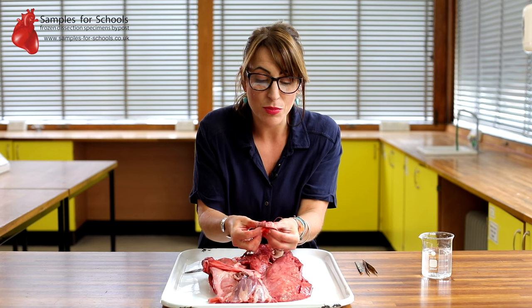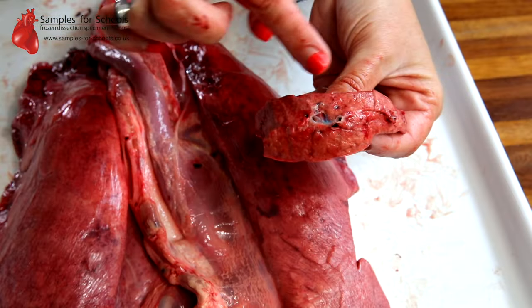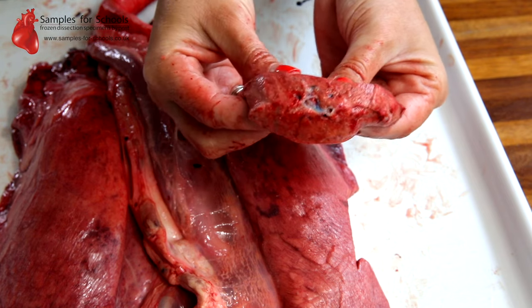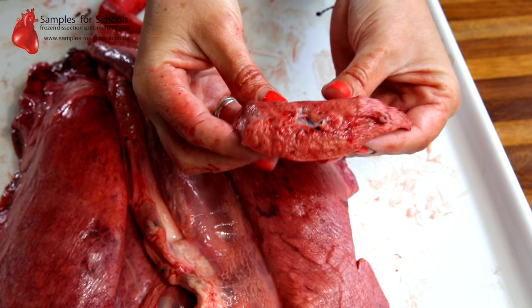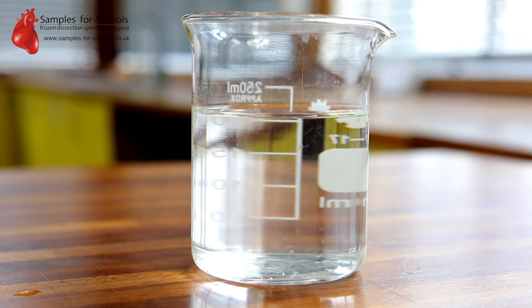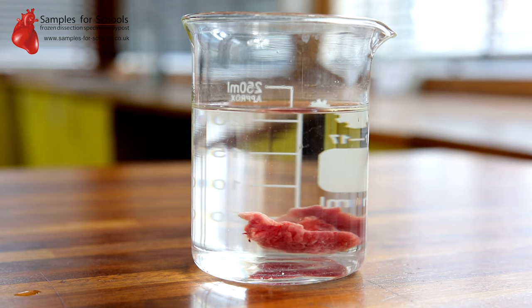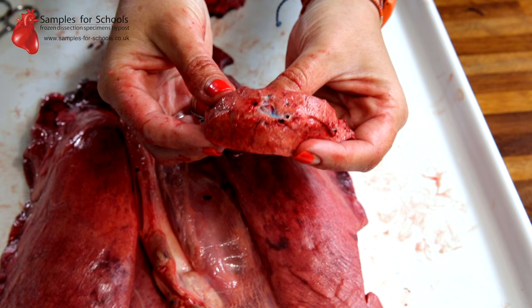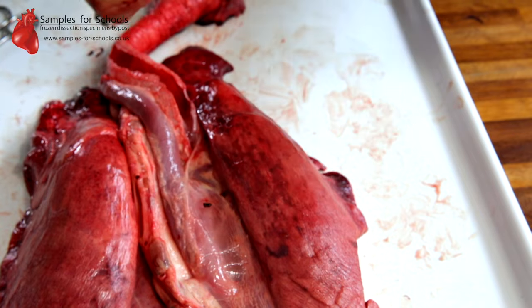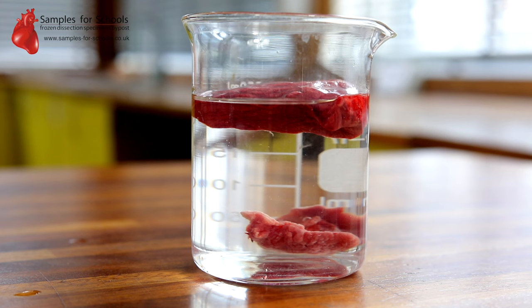So when we look in this sample, you can see the smallest branches of the tubes, the bronchioles, and they are still rough and rigid to touch. That's because they still have that cartilage in to keep them rigid and open. If we put muscle tissue into water, it sinks, because it doesn't contain oxygen. If we compare that with some of our lung tissue, it does float, and that's because those alveoli sacs still contain oxygen.